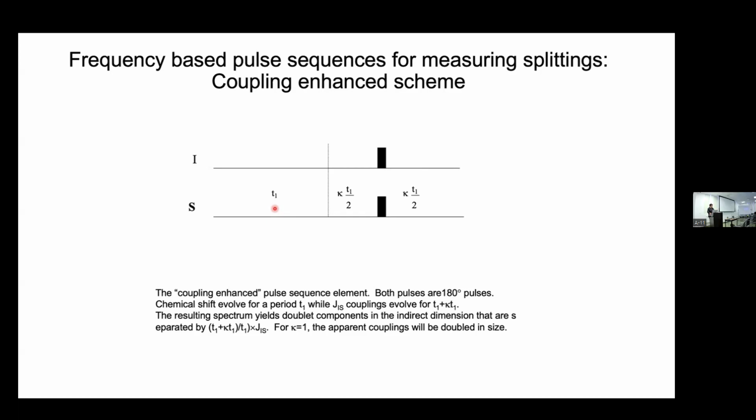I think Nico Chandra showed this. We see it also. The more dynamic the nucleic acid, typically our scalar couplings are smaller. But in general, one-bond scalar couplings were of no interest to anybody because there was no dihedral angle dependence, unlike three-bond couplings where you have the dependence on the intervening dihedral angle. There was really no reason at all to measure one-bond or these two-bond scalar couplings, except for RDCs, and that led to a whole swath of experiments that are optimized to get your line positions as accurately as possible.